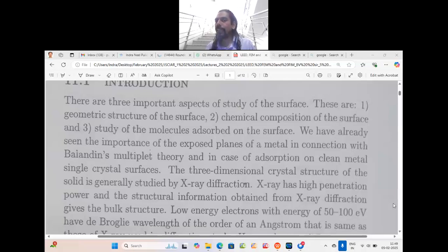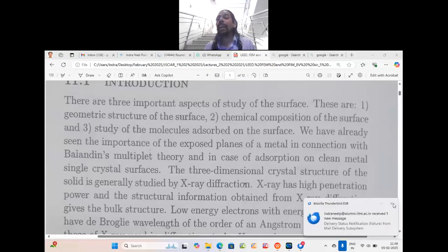When the electron is ejected from the K shell of nickel, it will carry a kinetic energy of specific value. When the detector detects the kinetic energy, the kinetic energy is a reflection of the binding energy of the electron emanating from the core level of the particular element, whether it is nickel or oxygen.